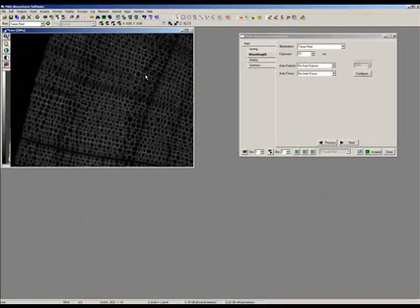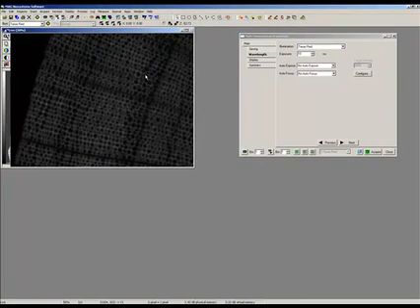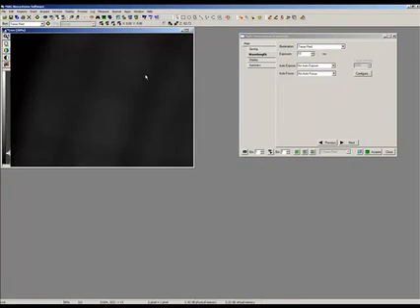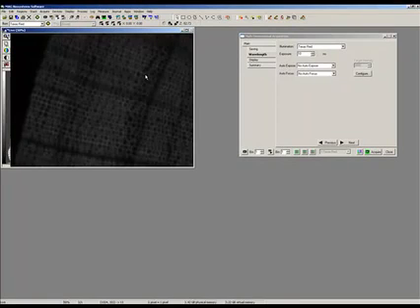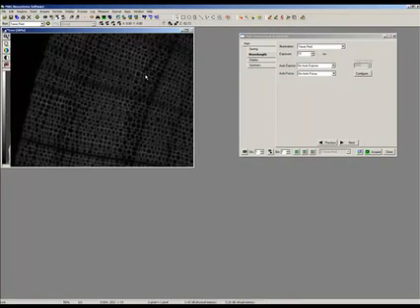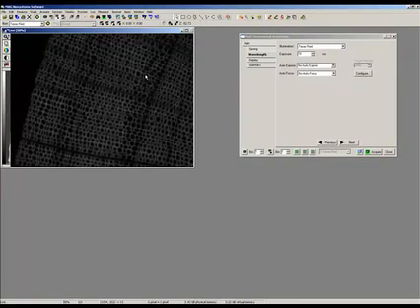Well, down at the bottom is this button live. And if we look at the bottom live, I've now got my image up, and I can just show you that that's live by moving backwards and forwards through focus. So I'm now completely live.